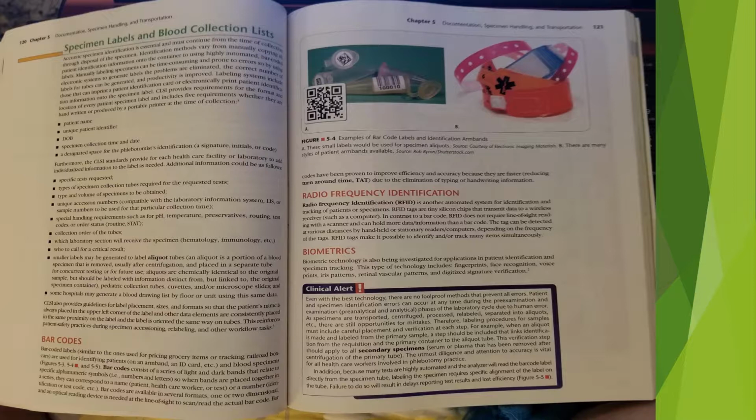Clinical alert. Even with the best technology, there are no foolproof methods that prevent all errors. Patient and specimen identification errors can occur at any time during the pre-examination and examination, pre-analytical and analytical phases of the laboratory cycle due to human error. As specimens are transported, centrifuged, processed, relabeled, separated into aliquots, etc., there are still opportunities for mistakes.